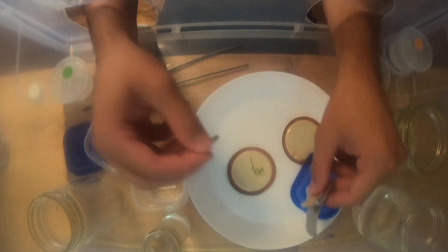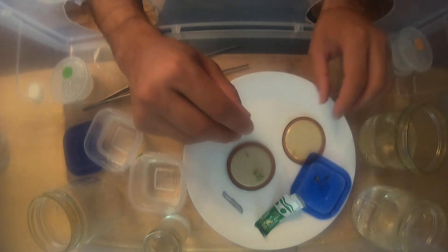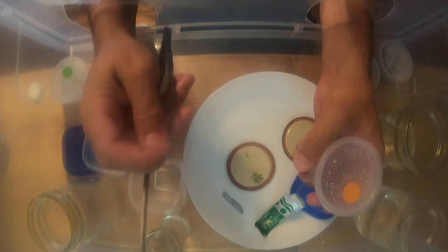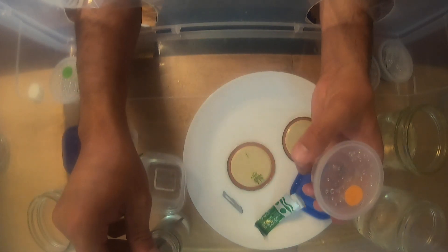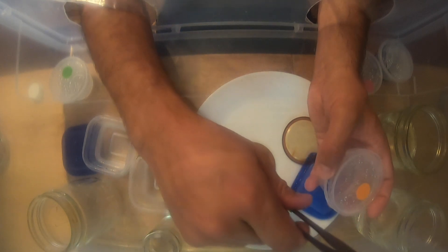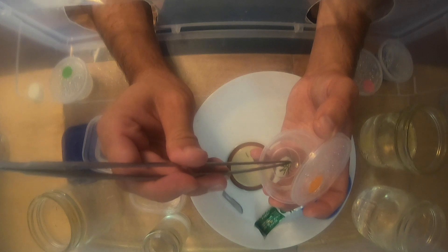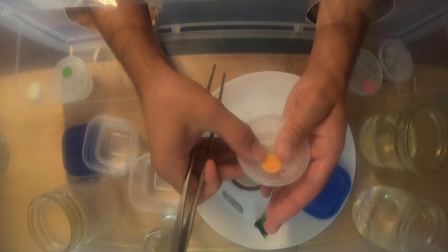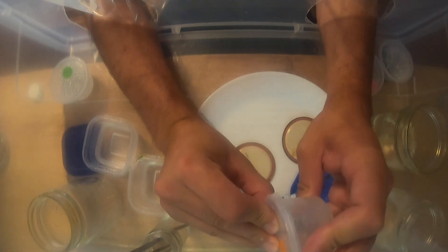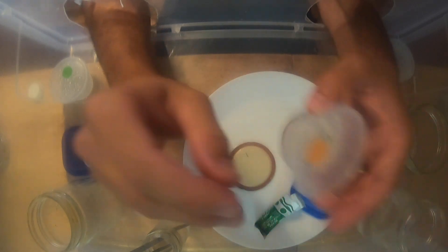I take the scalpel blade and cut off the tip of the stem because that part has been affected by the bleach. Then I crack open the media cup, put the forceps in the rubbing alcohol jar so they're sterile, quickly grab the plant, and get that stem into the media. I then crack the lid slightly and pour out any liquid that's in the media cup — excess liquid seems to kill the plants. And we're done with that one.